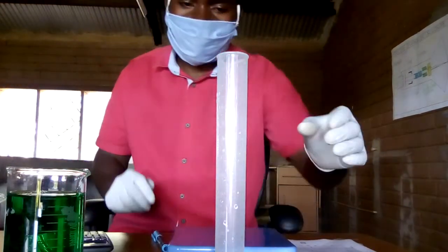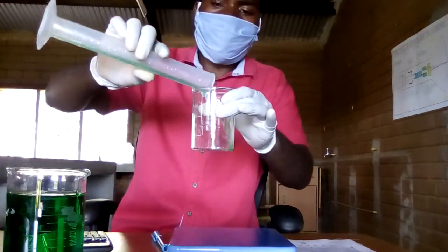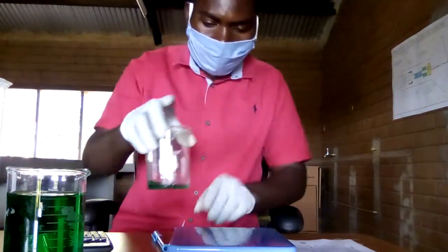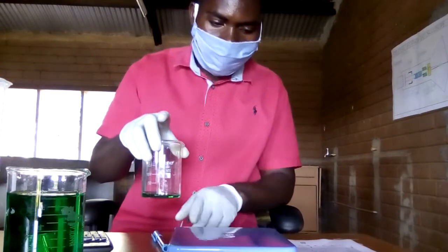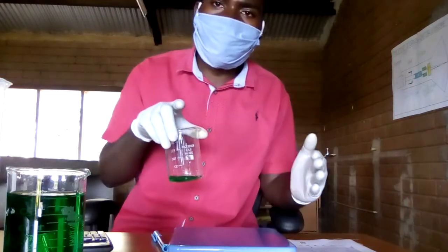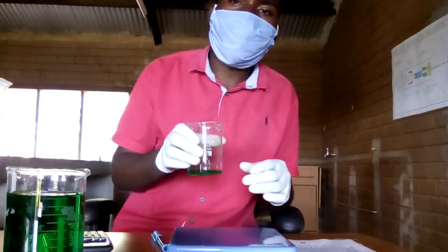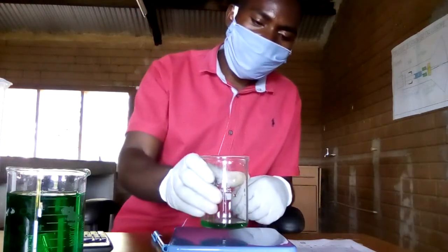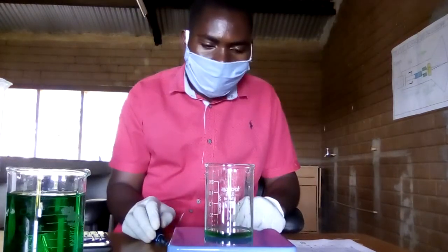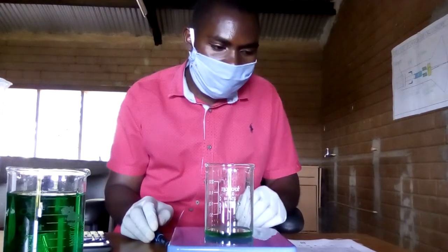Once I do that, I'm going to pour this liquid into the empty beaker, and the next thing I will do is to determine the mass of the empty beaker plus the mass of the unknown volume of the liquid P. What has been given to me is 113.3.